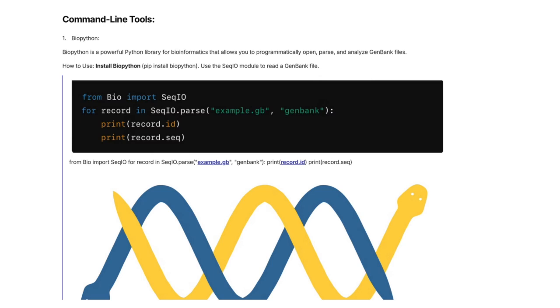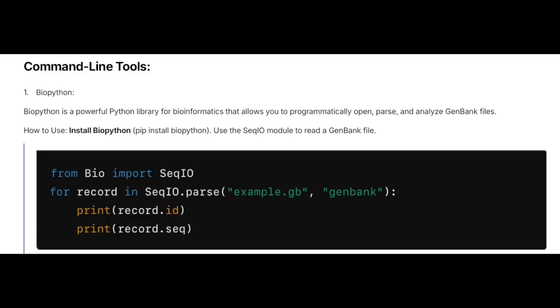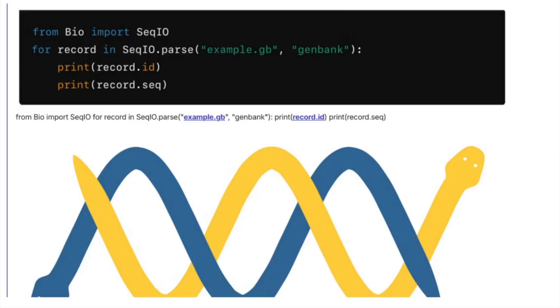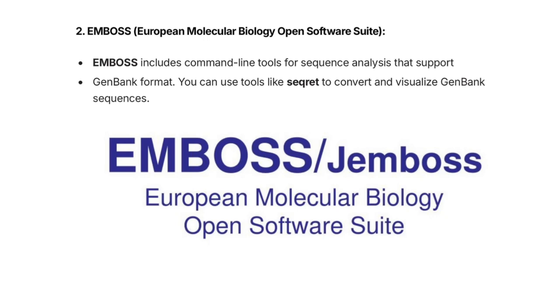For those inclined toward command-line tools, there is BioPython. BioPython is a powerful library for bioinformatics that allows you to programmatically open, parse, and analyze GenBank files. You first need to install BioPython, and then use the SeqIO module to read a GenBank file. If you're interested, you can pause and take a screenshot of the command shown on screen to use it to open your file.